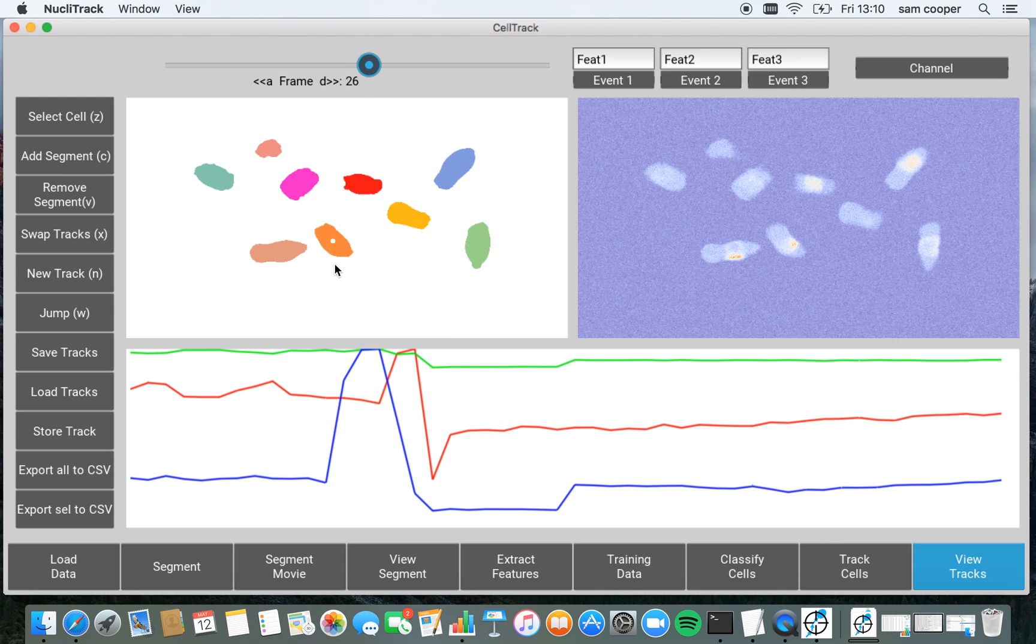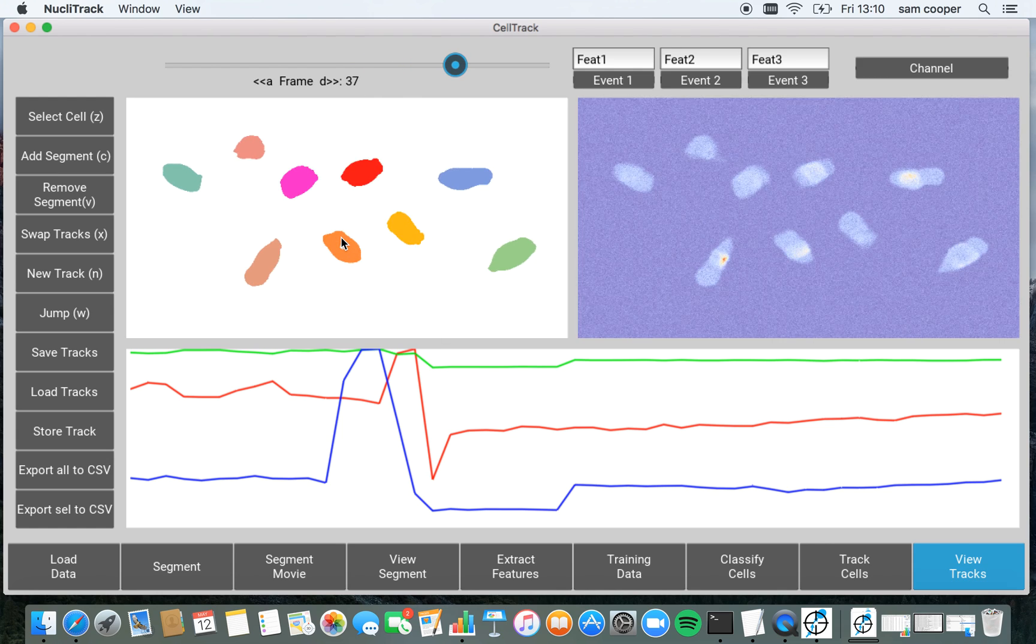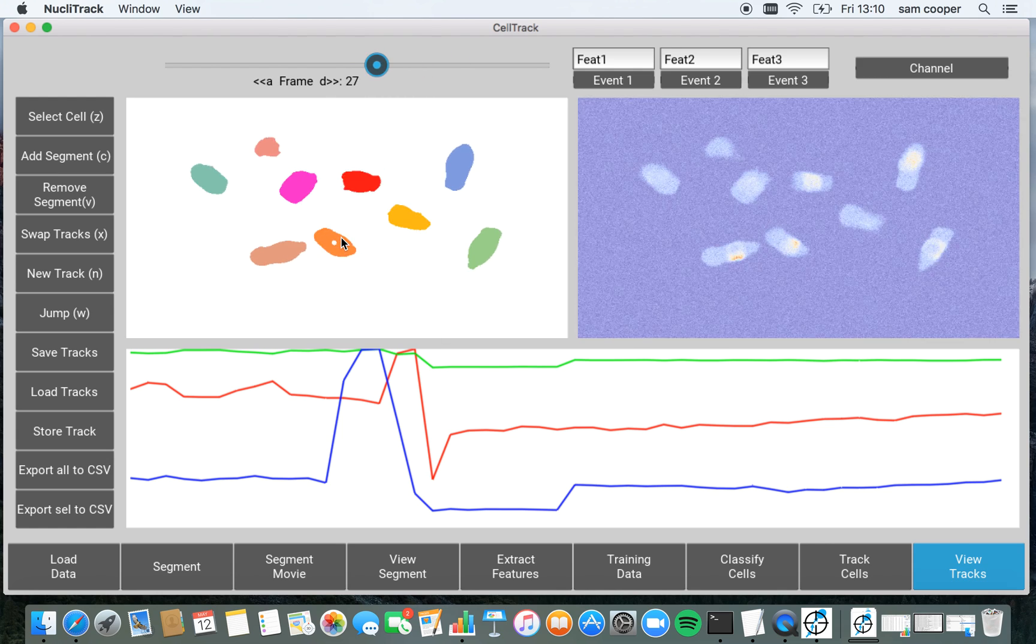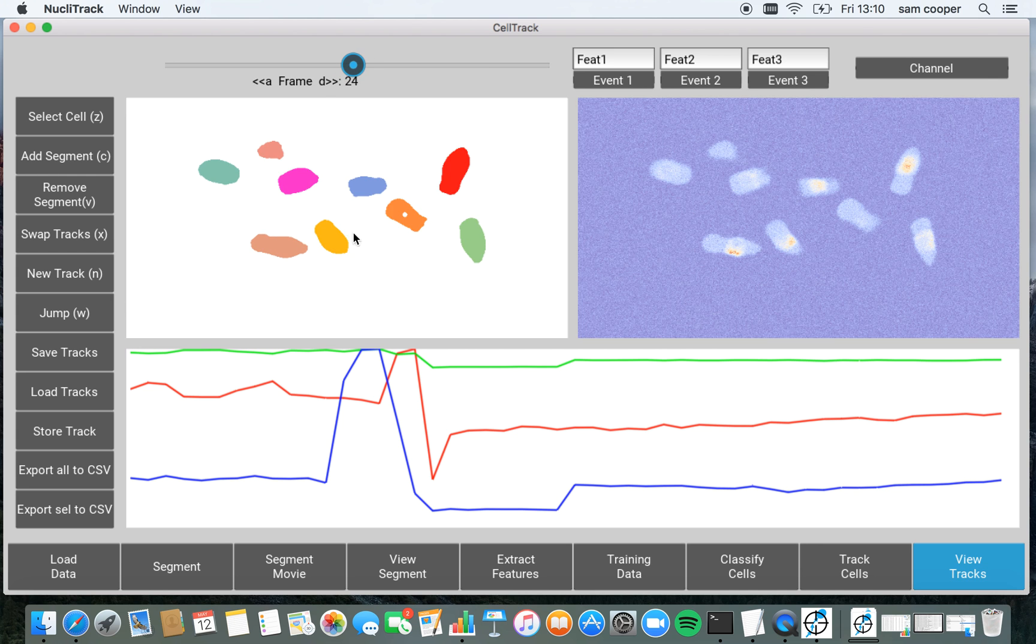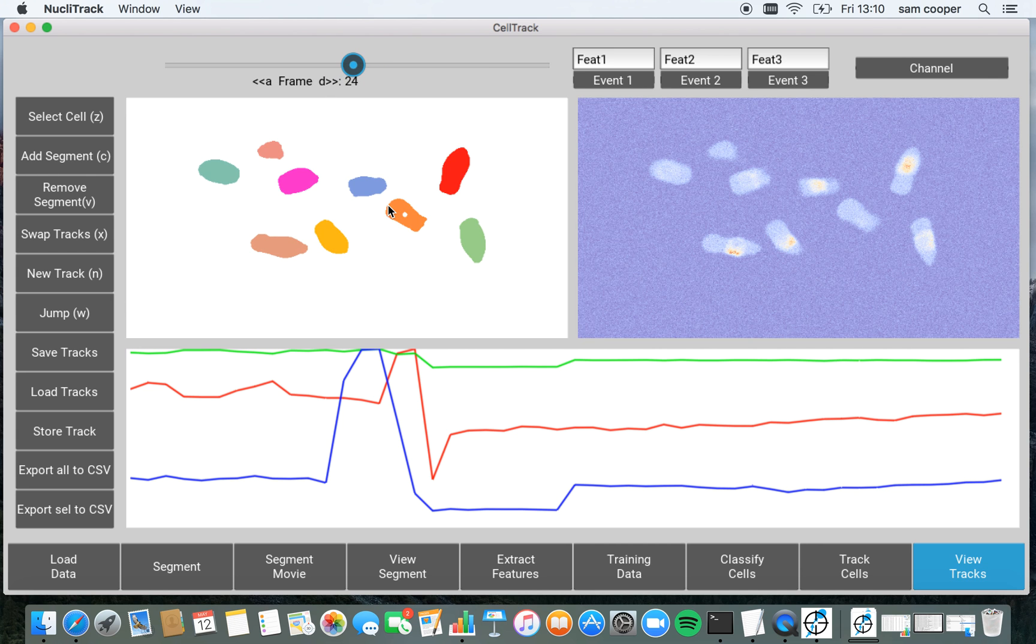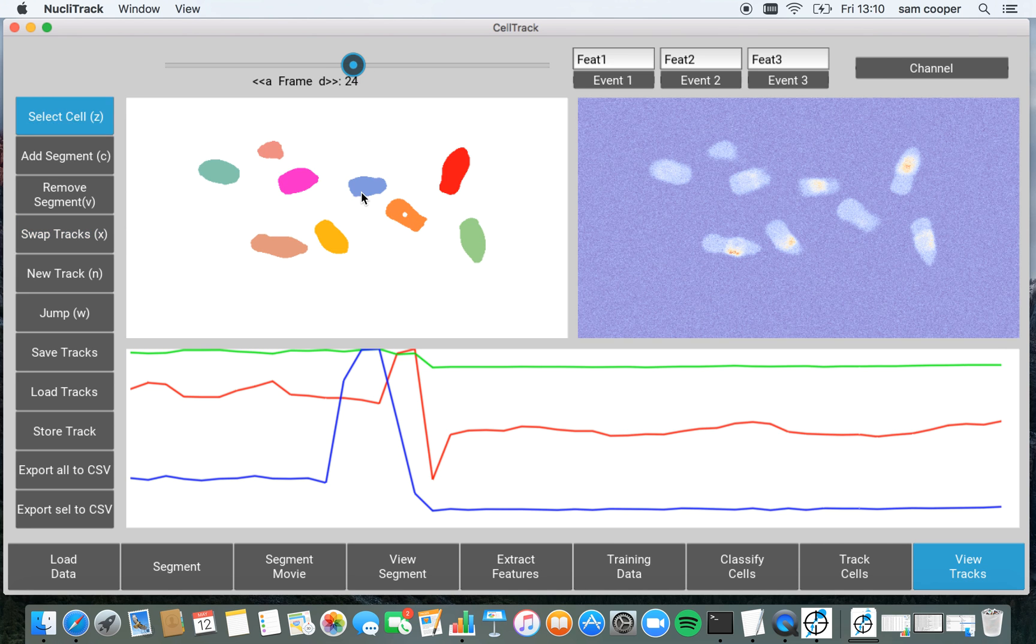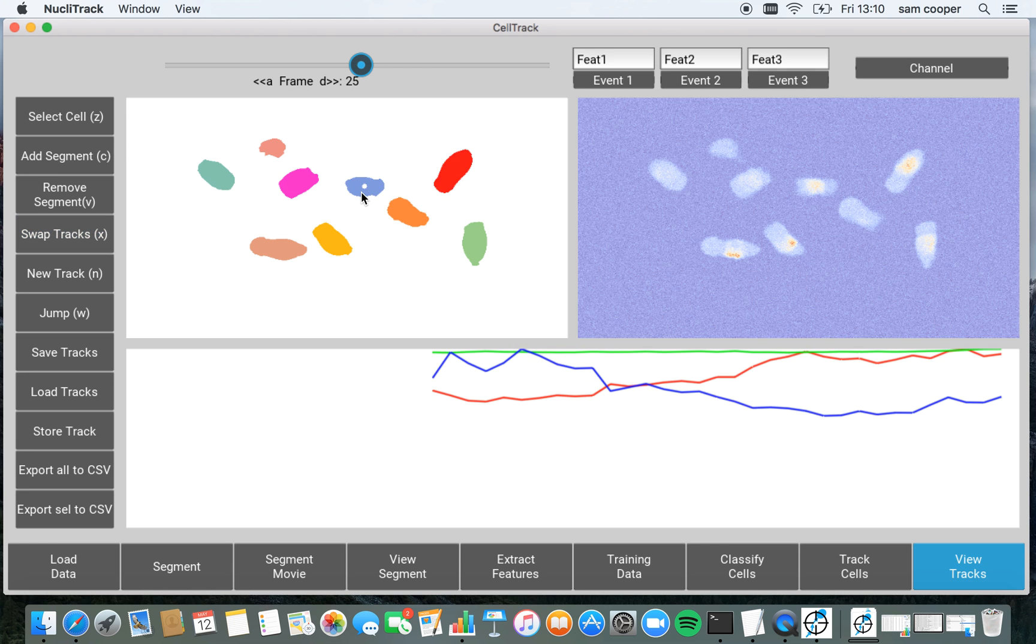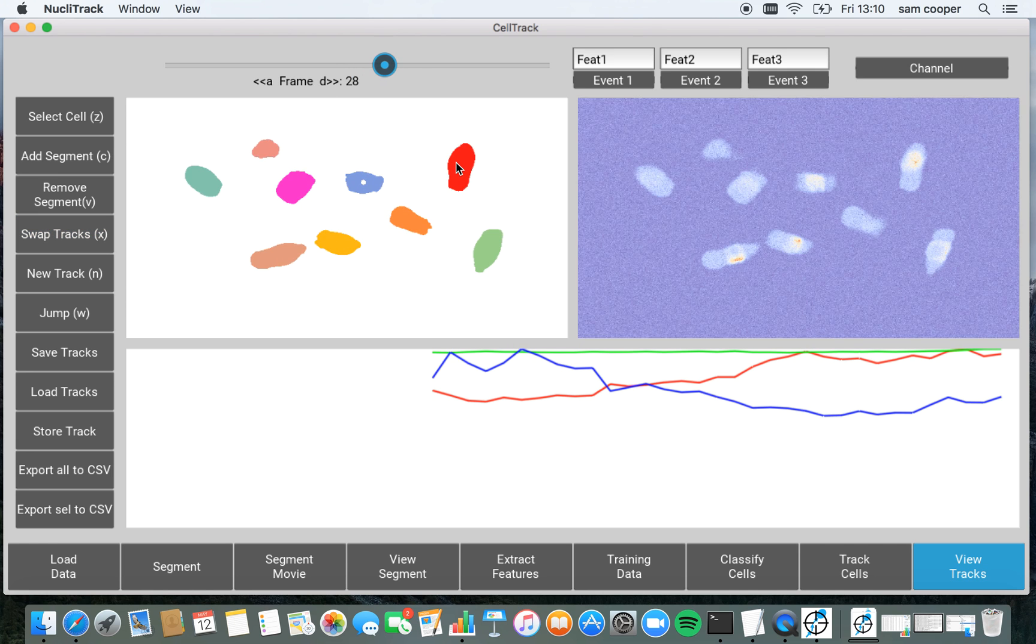So I now move on time points. You can see this track is now assigned to this cell here. This has now basically broken the track a bit. So I'm just going to correct this again by pressing X to swap it back. Selecting a new cell X to swap back. And now all the tracks are correct again.